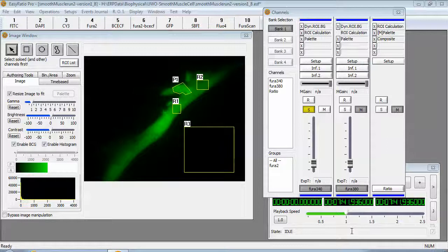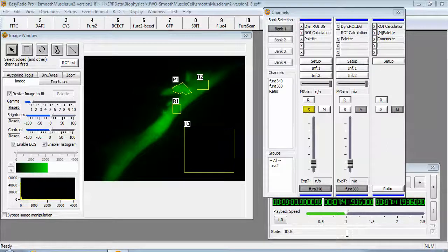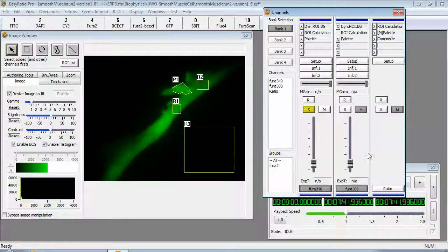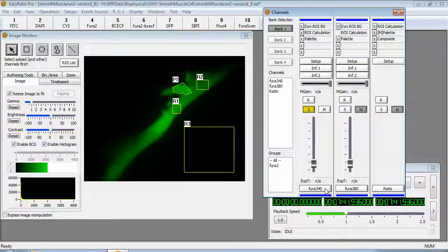In order to export data to Metafloor, the simple procedure is selecting the channels that you wish to export. The channel selectors are at the bottom of the channel strip windows. Just simply select them so they become dark gray.